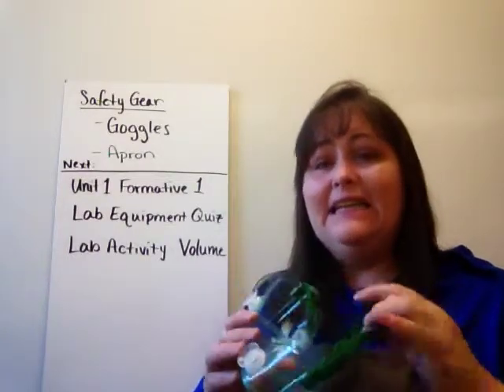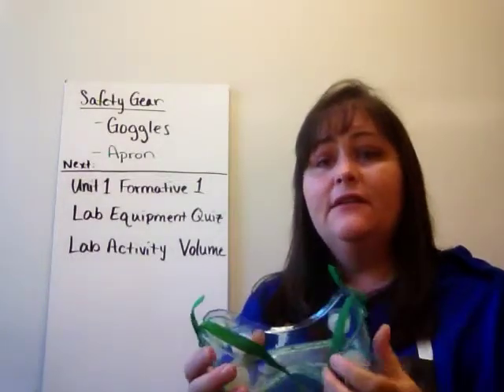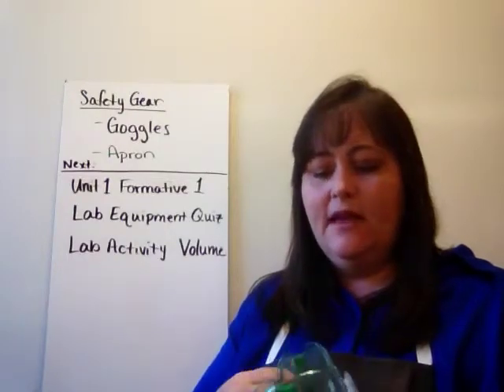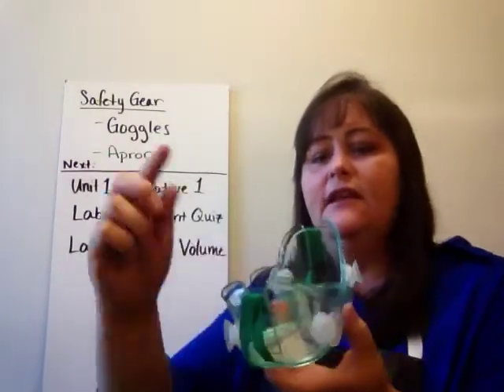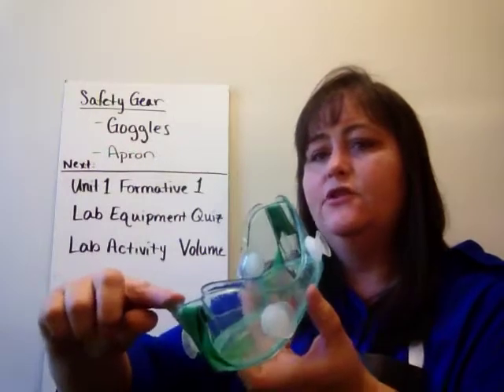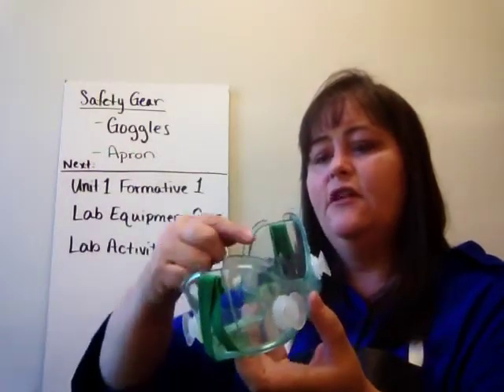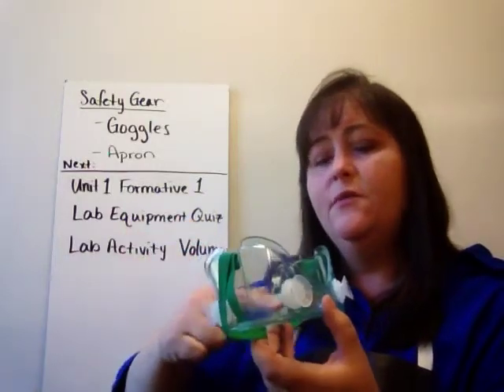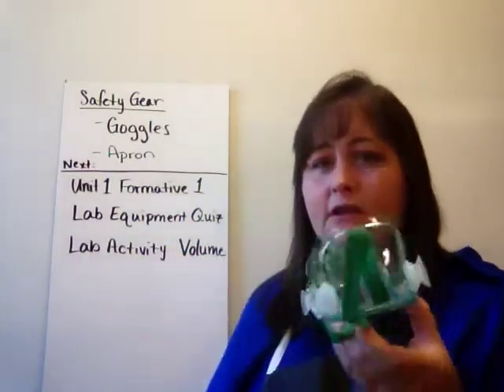Now, we will be cleaning the goggles. Quick lesson on cleaning goggles. You're going to use an alcohol swab, and you're going to take the wet alcohol swab and swab just the parts that are going to go against your face. And every time you put them on, and every time you take them off, you're going to do this.